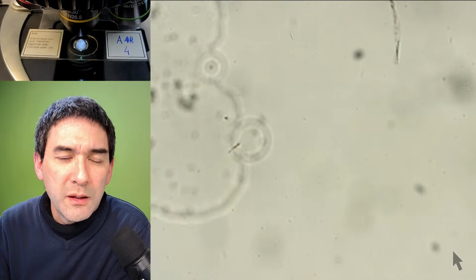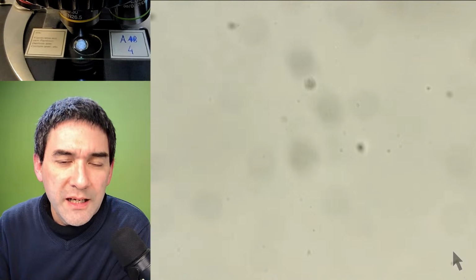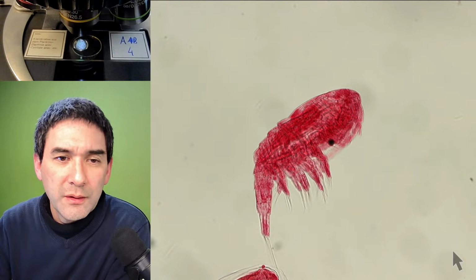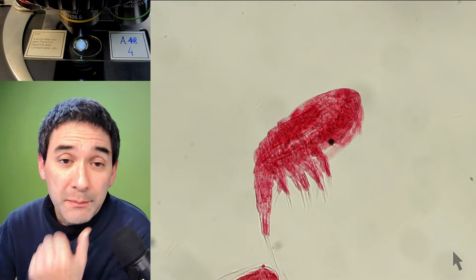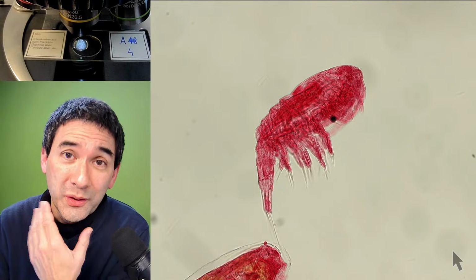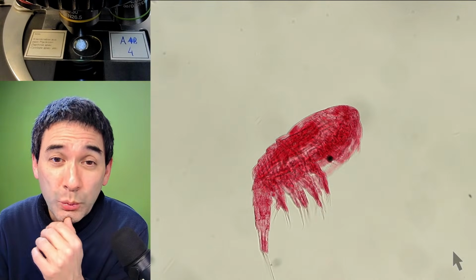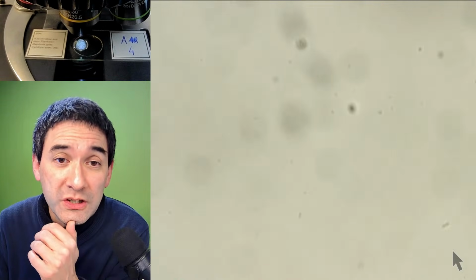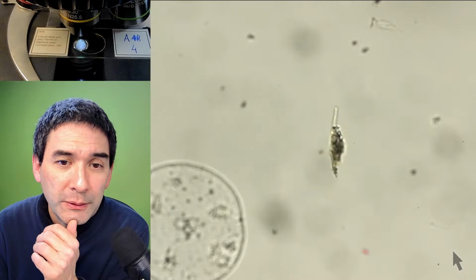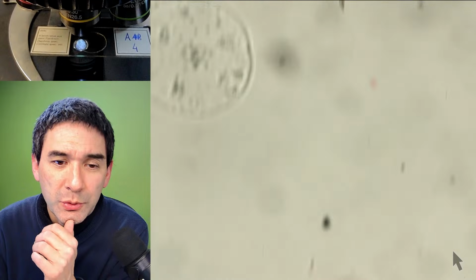A permanent slide. They have an exoskeleton, of course. This basically means that they maintain their shape when you make a permanent mount. Normally, delicate water organisms like algae you want to mount in so-called glycerin gelatin, a mounting medium which does not completely dry out. But this one over here is completely dried out. So where are the others?